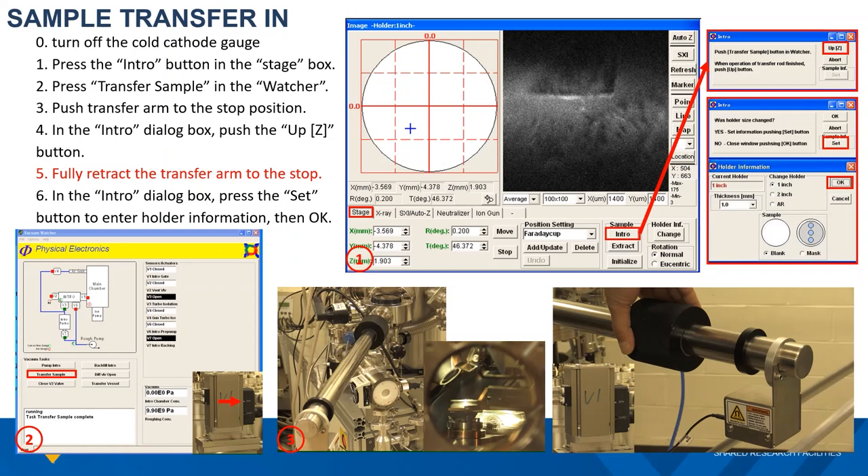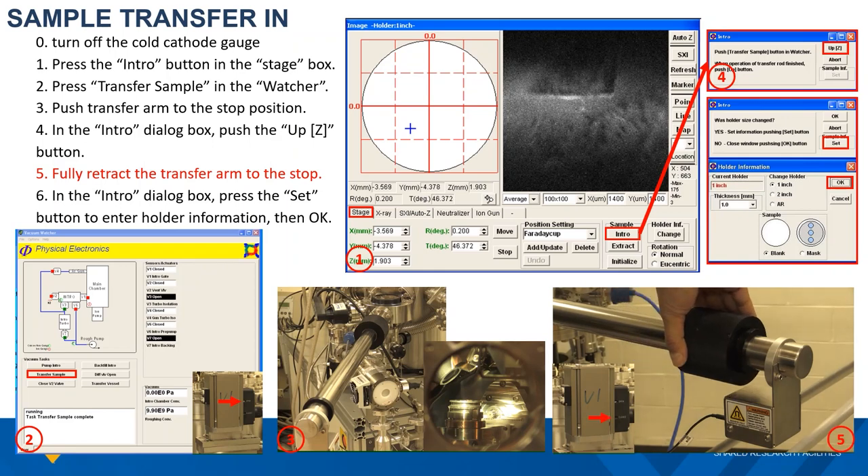Go back to the sample intro window and push the up-Z button. This will raise the stage slowly to catch the sample from the bottom. Once this motion stops, fully retract the transfer arm. There is a magnetic sensor at the end of the transfer position, so make sure you fully retract the transfer arm to the stop position. That will trigger the detector and send the signal to close the gate valve.